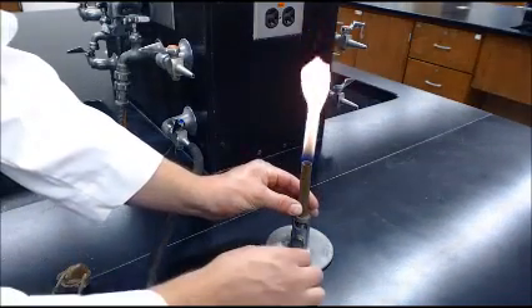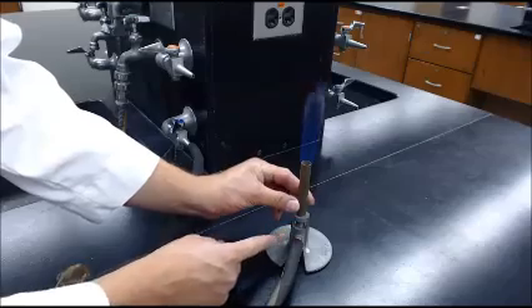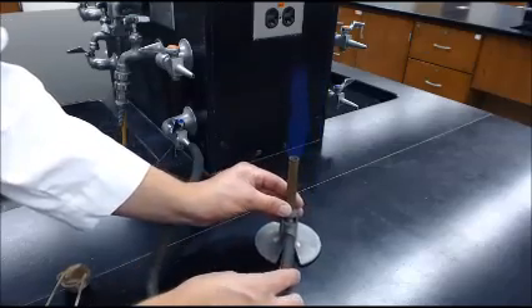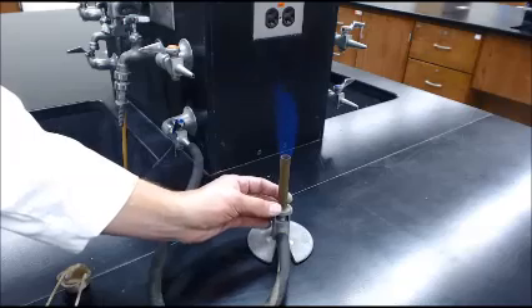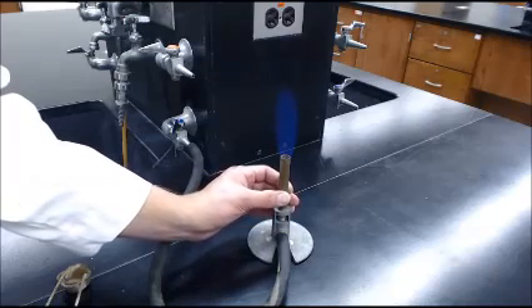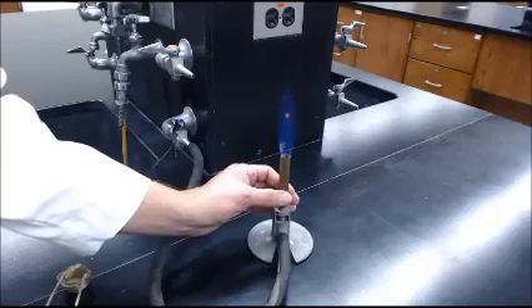To make it hotter, we can open the barrel by turning it counterclockwise and it will allow more oxygen into the flame. You can see now a blue flame starts to show up. This is getting hotter now — blue is hotter. And the more oxygen that I let in, the hotter it will get.